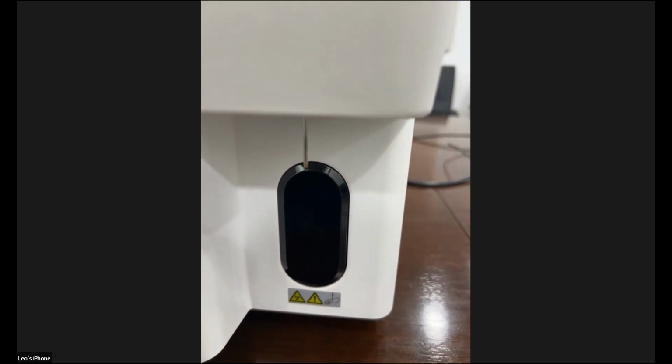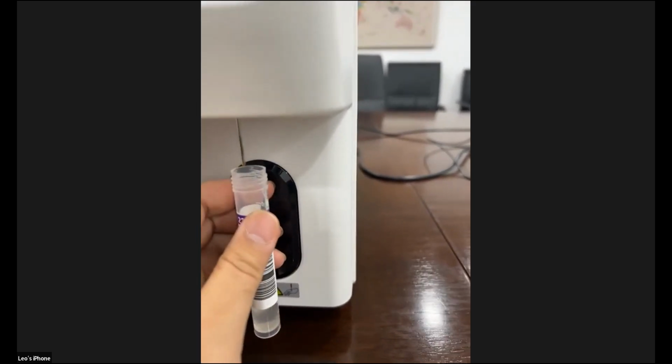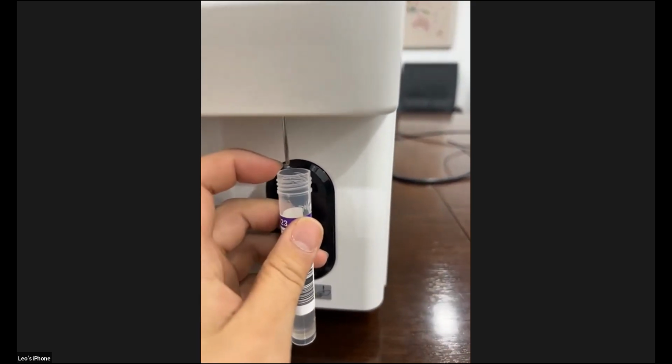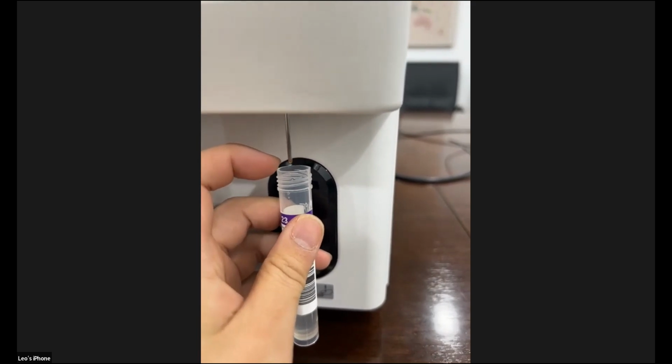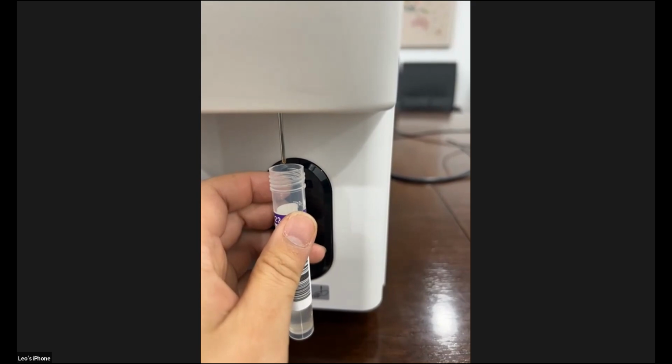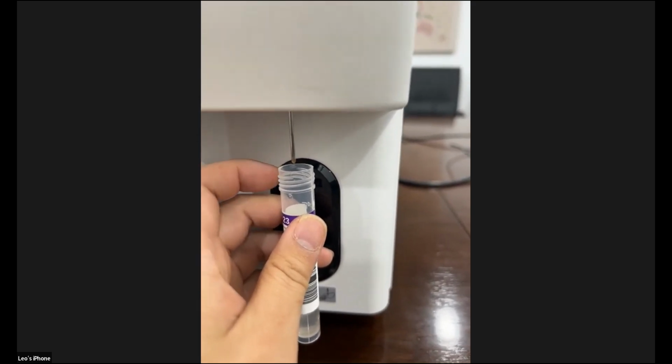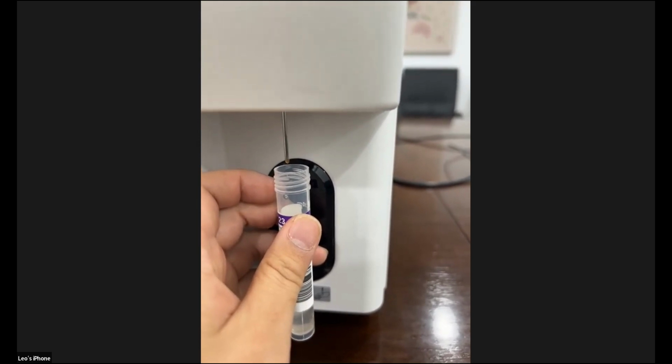That means we need to place the top of the tube at the same level as the bottom of the probe. So this probe position is the reference position where we can place the tube. Leo.